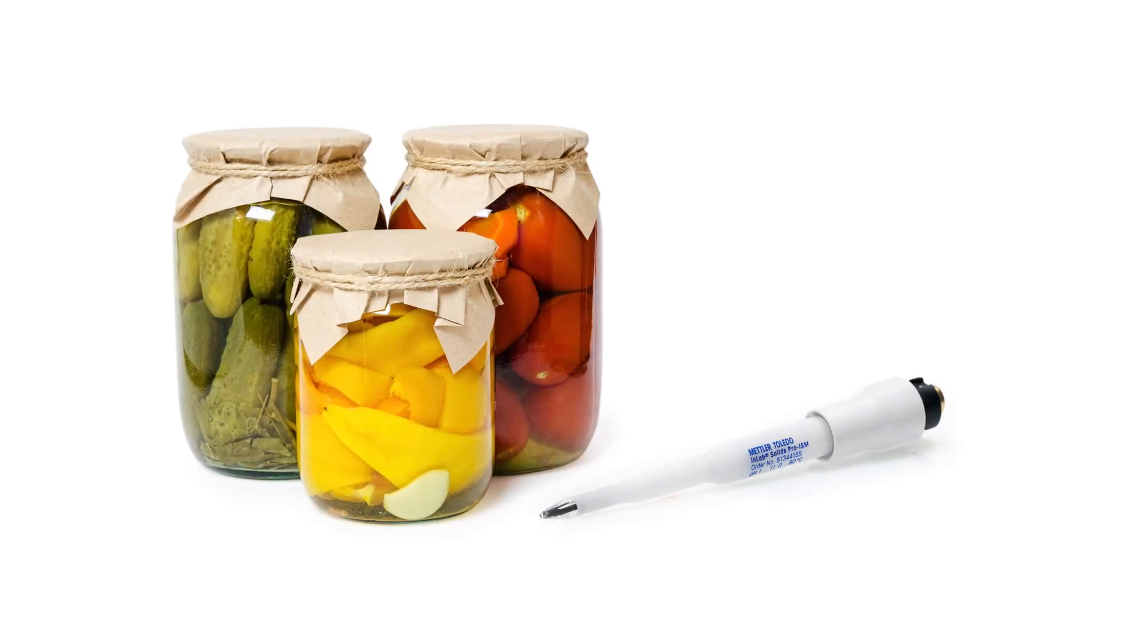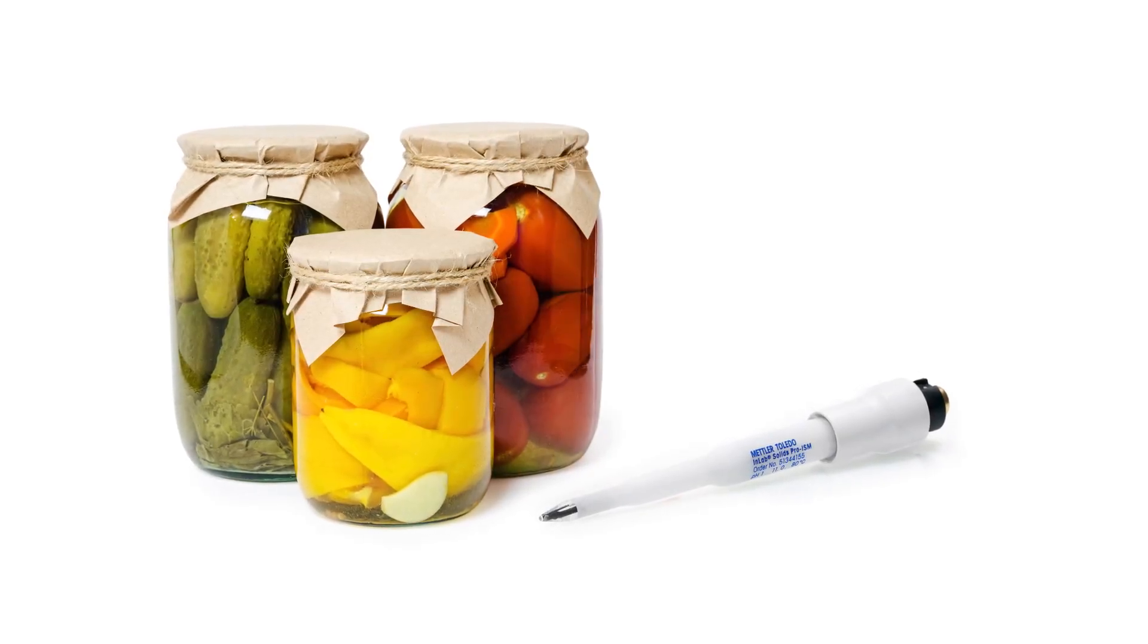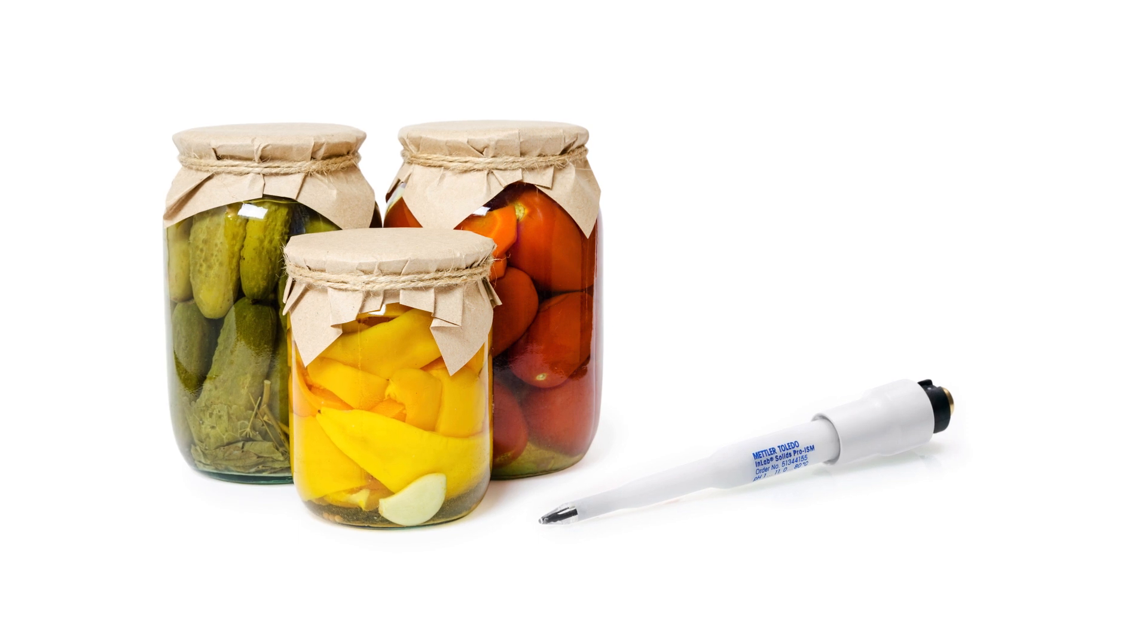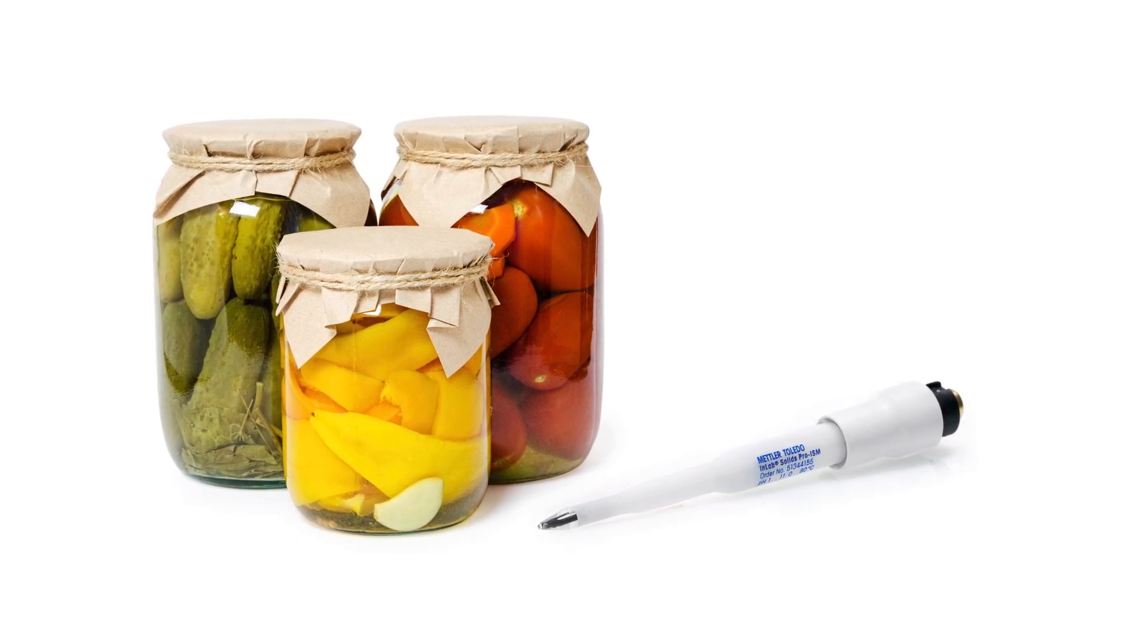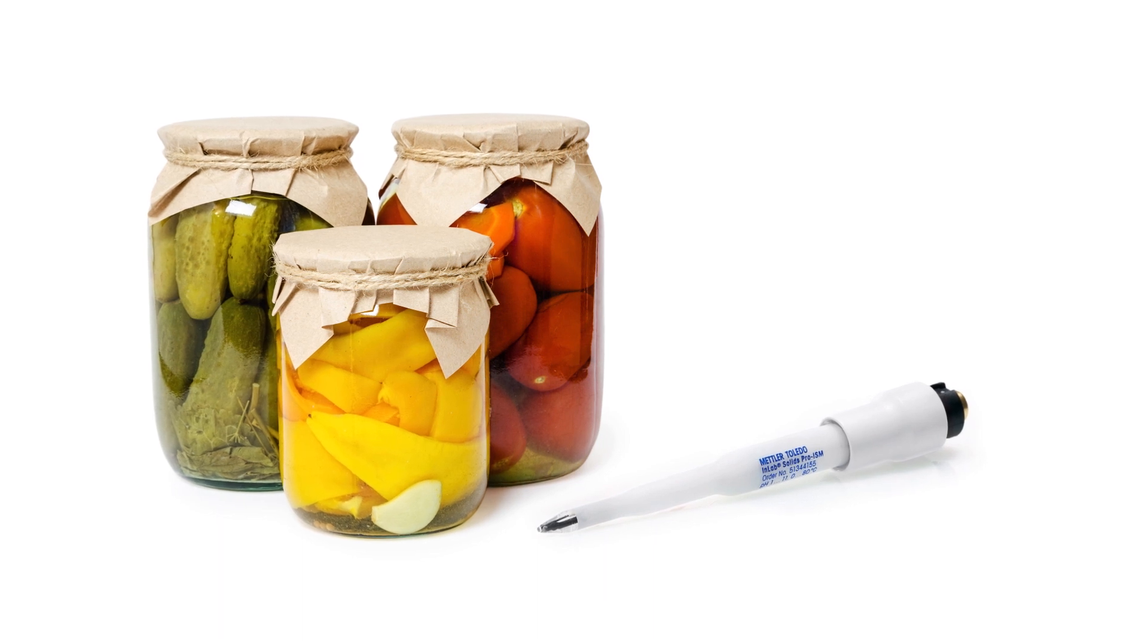Mettler Toledo offers a specialist electrode InLab Solids Pro ISM for the pH measurement of canned food samples. The electrode is low maintenance and delivers desirable performance.